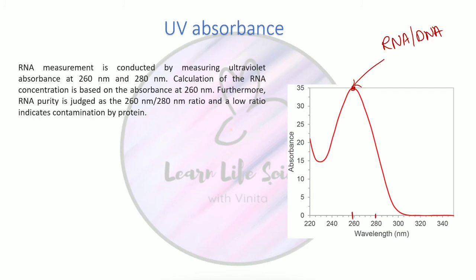If you observe a peak at 280 nanometer, for example, if I prepare another graph like this, we'll change the color. If I got another graph like this, for example, I have taken this. So you can see two peaks. You will see two different peaks.